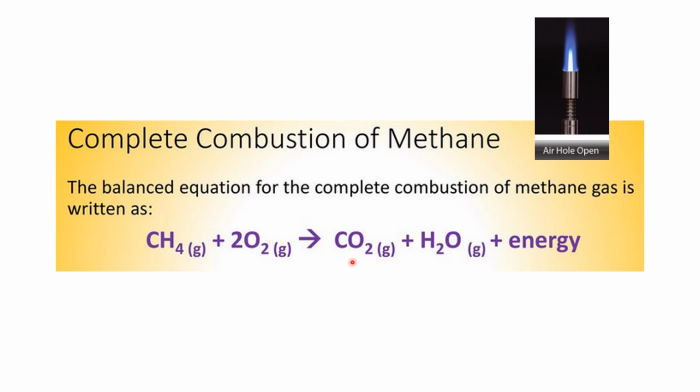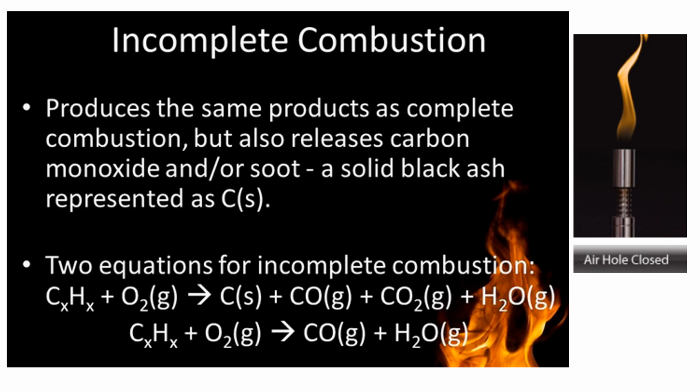Again, when the product of reaction is carbon dioxide and water, that is complete combustion, meaning all of your fuel has been transformed to carbon dioxide. On the other hand, if there is insufficient air or oxygen because the air holes are closed, the resulting reaction is called incomplete combustion.